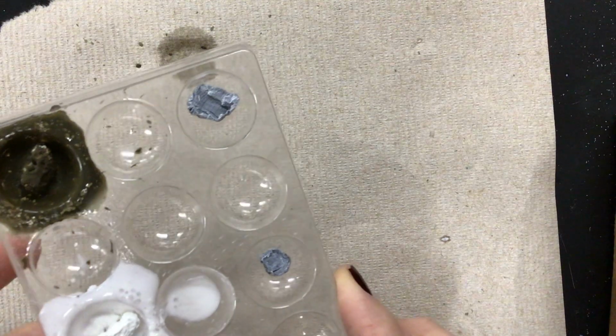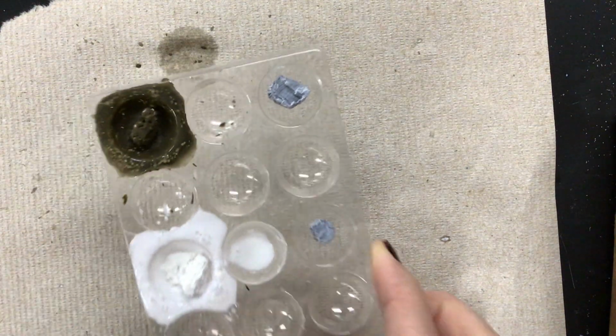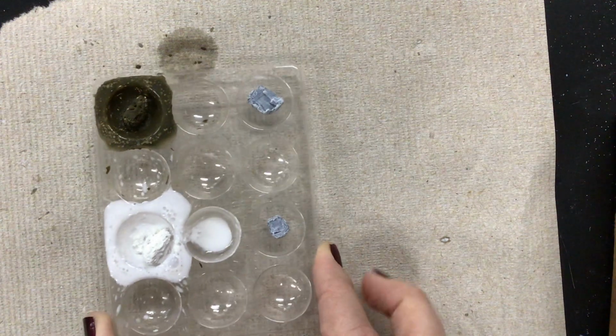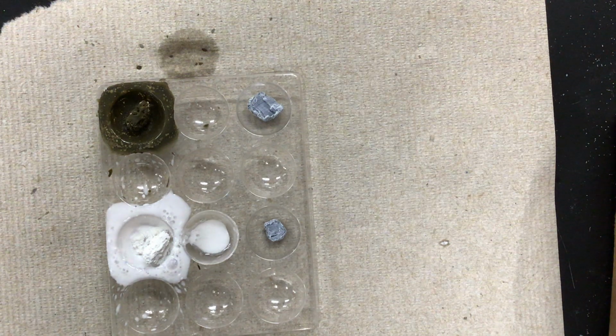That one actually might have melted the reaction plate a little bit. The reaction plate's kind of squishy. So it is very, very hot on the bottom as well. So that was a very exothermic reaction as well. So that one was a very violent reaction. So hopefully you guys can write down some observations in that data table. That was exciting. All right, the next one.